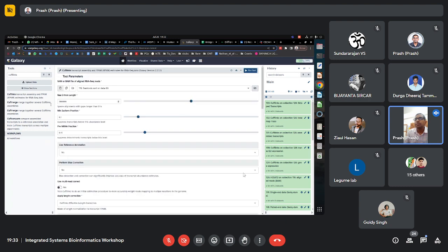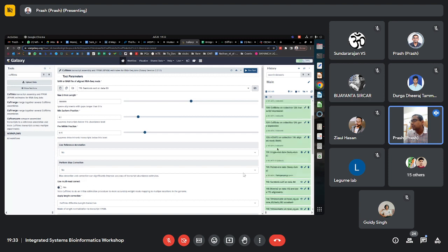So click Cufflinks. Here you get it. The result was HiSat2 126, isn't it? So here you can give the copy link.